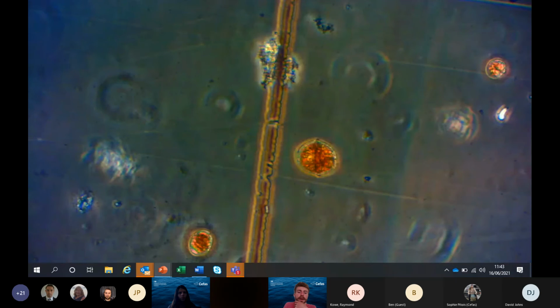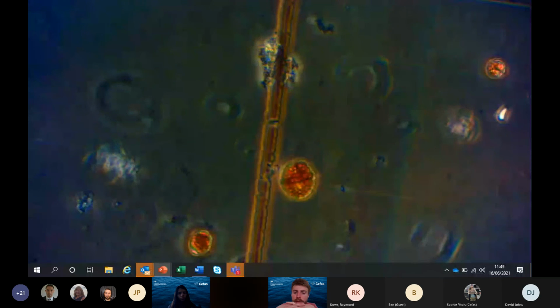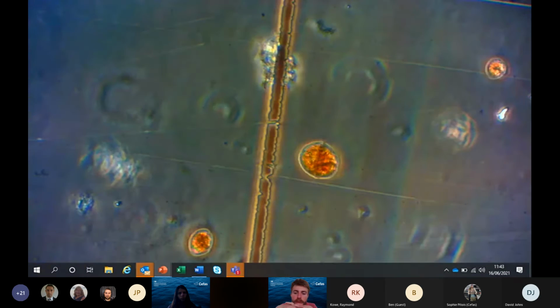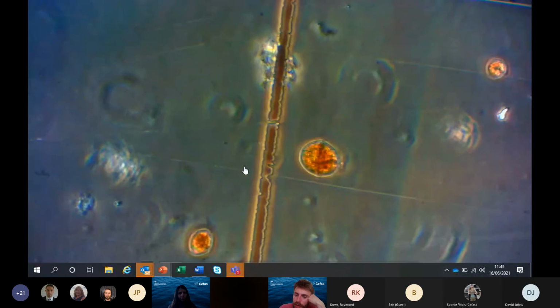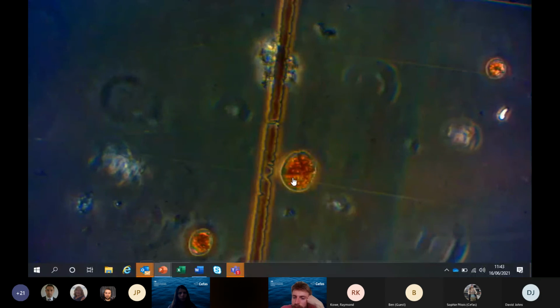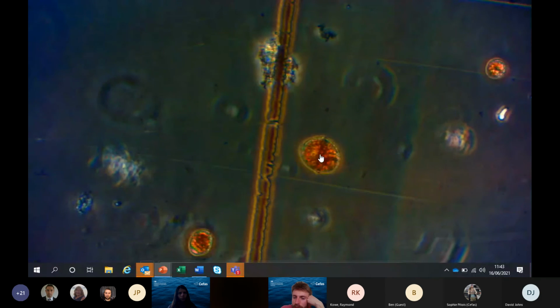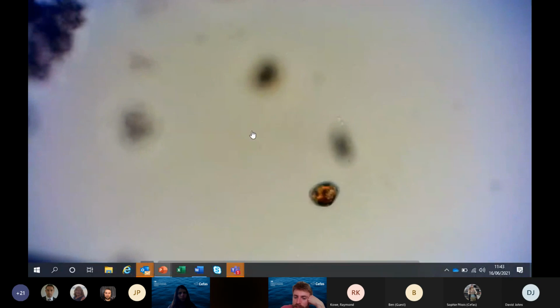I've got a short little video now of some live cells and some of that fluorescence I talked about earlier. This may be a bit jumpy at first, but you'll have to bear with it. So this, for example, is a species called Gymnodinium. This is from a culture we were given from some colleagues in Weymouth. And you can just about make out in the middle of the cell that girdle, that sort of dark line. And then this is another species called Prorocentrum micans.